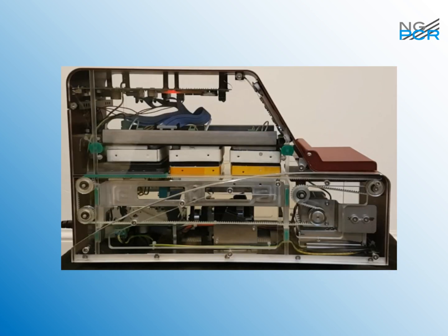Now, the next slide is a picture of the machine which you saw in the first slide, but with clear sides, so you can look inside. Now here you see the top block of the annealing zone, and here the bottom block of the annealing zone. It's isolated in this one. This is the extension zone, top block, bottom block, and this is the denaturing zone, top block, bottom block, also isolated. And then between the blocks we can move the plate, which is loaded here in this zone, is moving on a belt all the way to the denaturing zone, and then the blocks close.